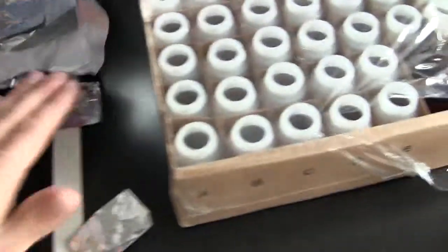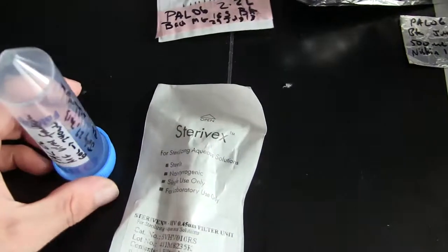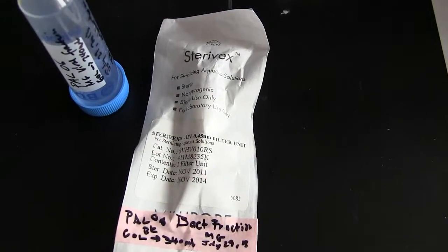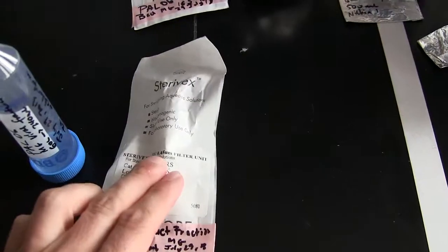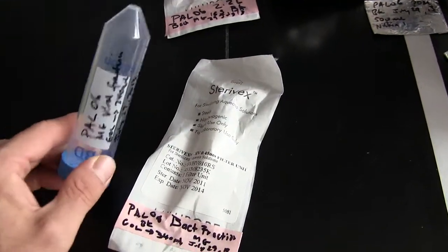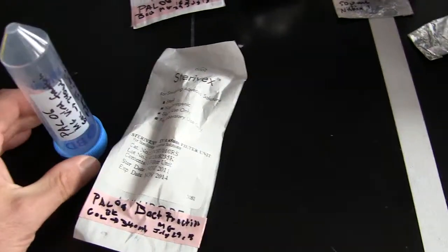If you also, in a given day, collected metagenome samples with the vacuum pump, with the bilge pump, and you collected them in the blue collapsible 5-gallon 20-liter cubies, then what you have to do at the end of TFF concentrating your 60 liters or so of seawater down is filter the concentrate through a 0.45 Sterivex, and then you'll collect the liquid that goes through the 0.45 in Falcon tubes and add chloroform.